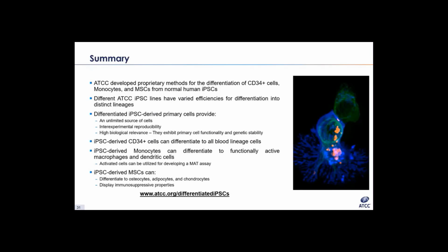Now for this next question, what is the optimal cell confluence when passaging the mesenchymal stem cell? So, right, the iPSC-derived mesenchymal stem cells are different from the other two flavors of differentiated iPSCs that we have because you can passage them, and really 85 to 90% confluence is optimum. We definitely do not recommend going beyond 95% confluence.